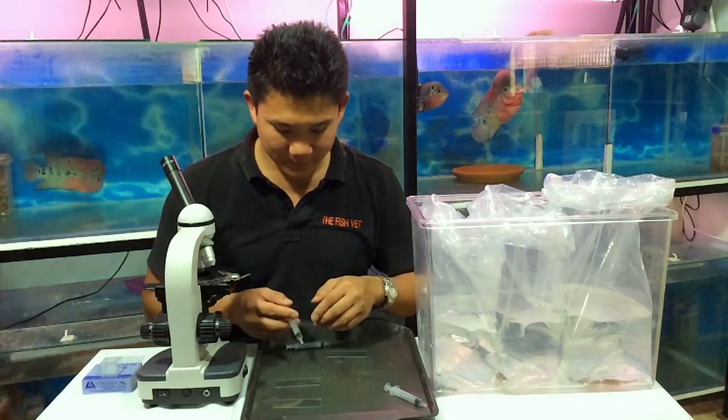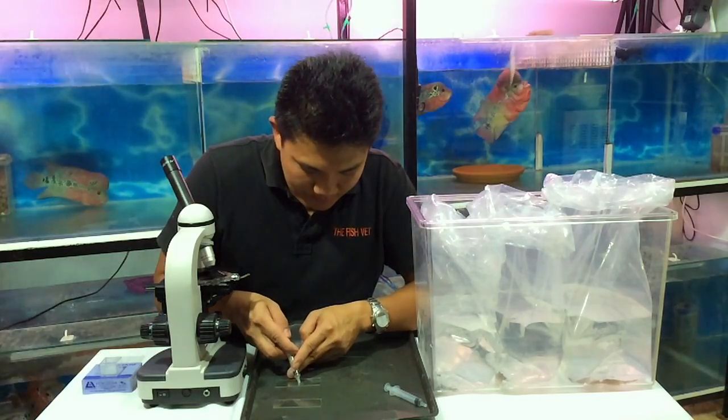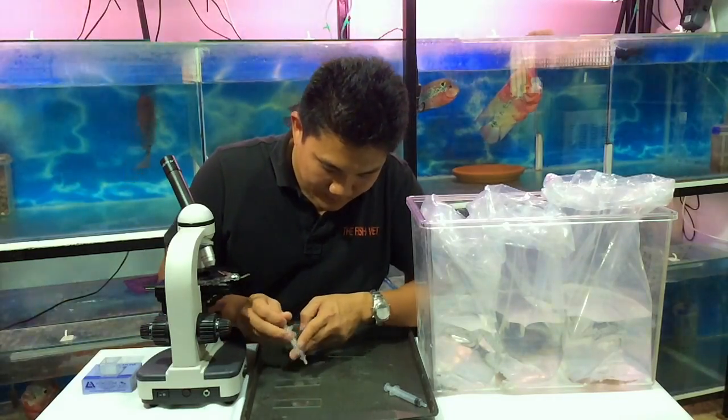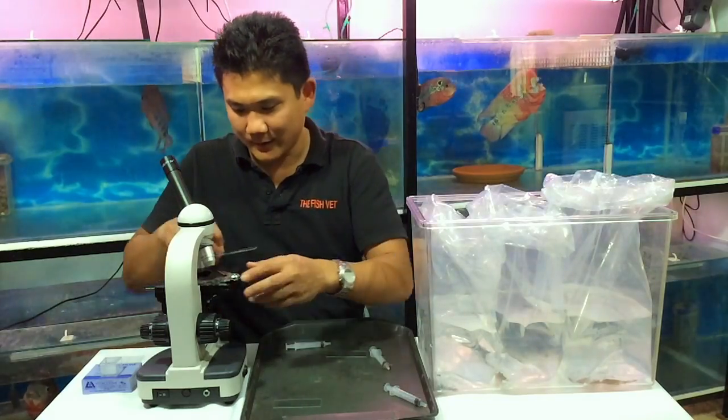So now we've got a sample from the Panda Corydoras and we're just going to put the sample there again. We're just going to pump it up and down to sort of break up the pieces of the stool sample a little bit, so that you'll be able to view things much more easily on a microscopic cross section.